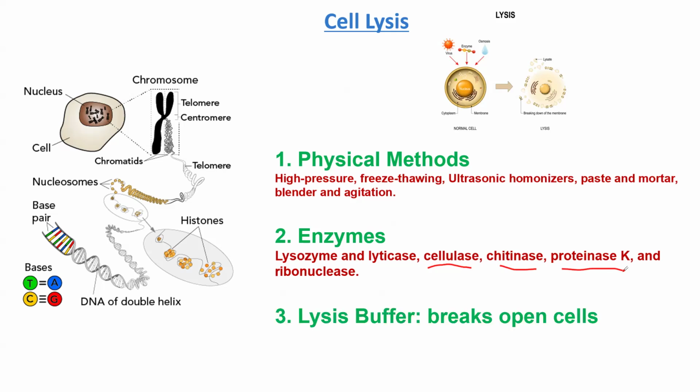Then the next thing is lysis buffer. You can also use lysis buffer to break open the cells, because this lysis buffer contains many components. It contains detergent.